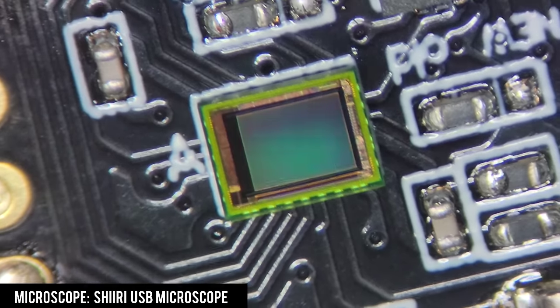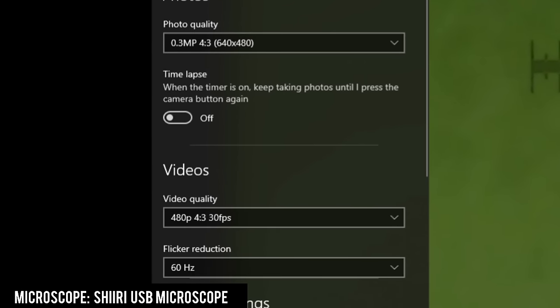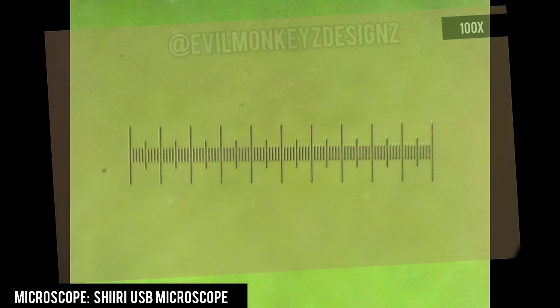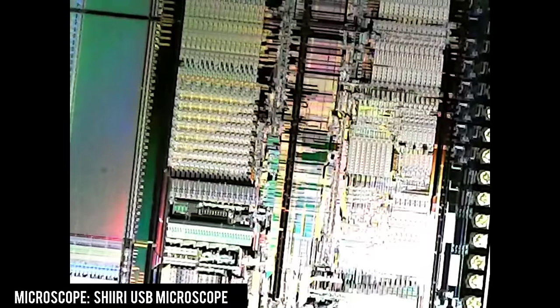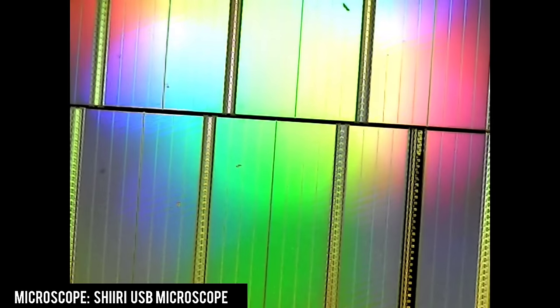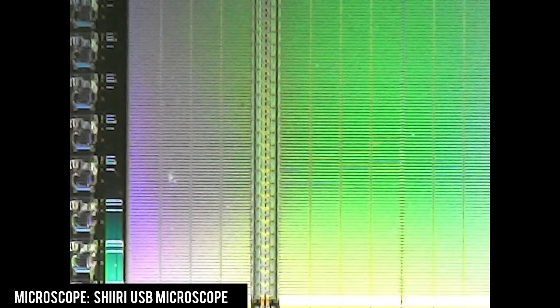After plugging into my USB port, Windows reports this as a 0.3 megapixel sensor capable of 640x480 resolution. The first photo I took, fully zoomed in, looks very similar to the 100x magnification photo. I also recorded some 480p 24fps video. Moving over to where Sonic is, the photo again looks very similar to 100x magnification — so I'm confident in ballparking this around 100x. Unfortunately this is nowhere near the 1600x indicated on the microscope. Coupled with the 0.3 megapixel sensor, the image quality just isn't very good. This microscope may be nice as a toy but it's not good for looking at silicon chips.